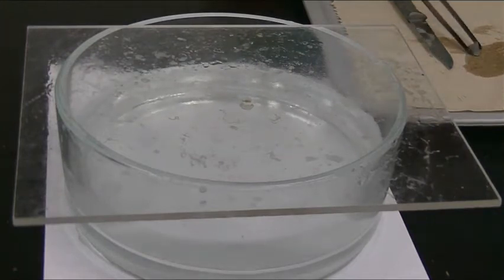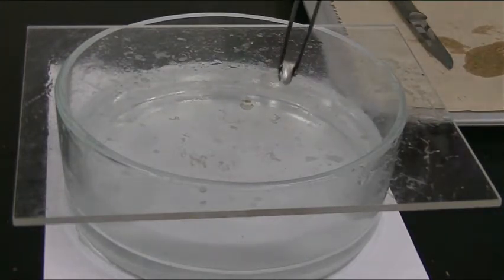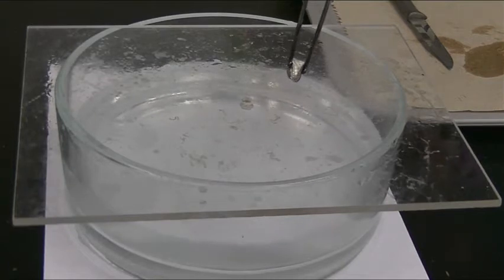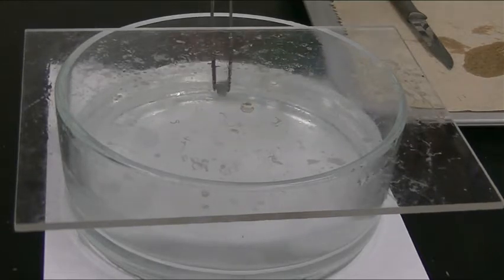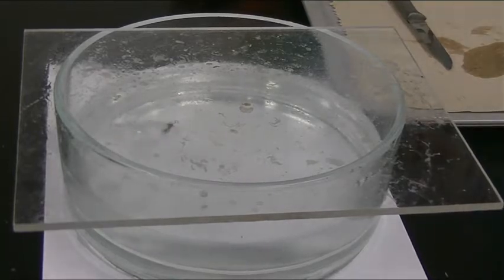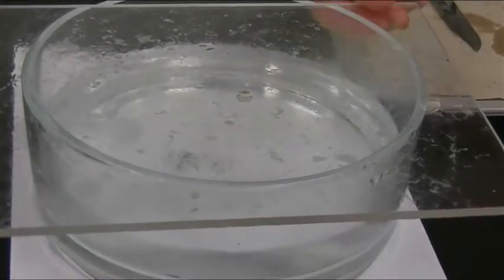And you would notice that when you usually have a piece of metal, it doesn't normally do anything when you put it in water. A penny will just sink. So anything that is a metal usually doesn't react. However, when I push this lithium into here, you can see it's starting to bubble.